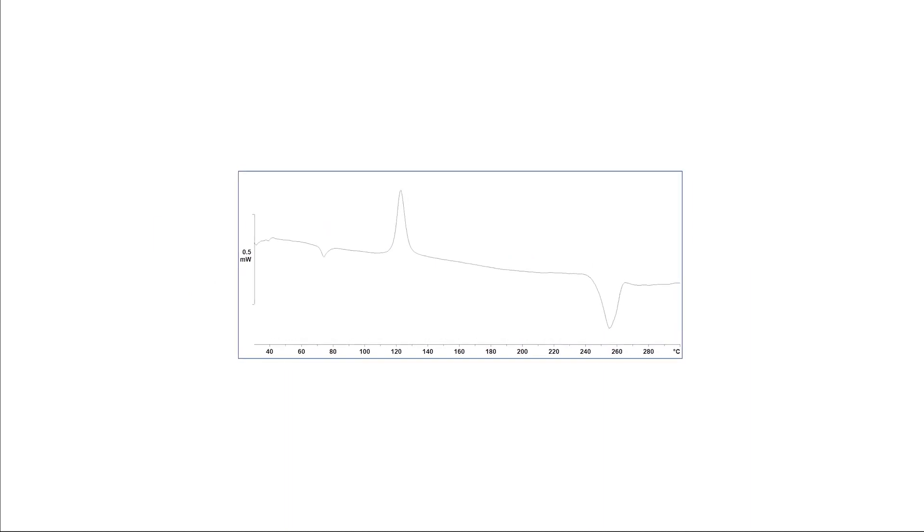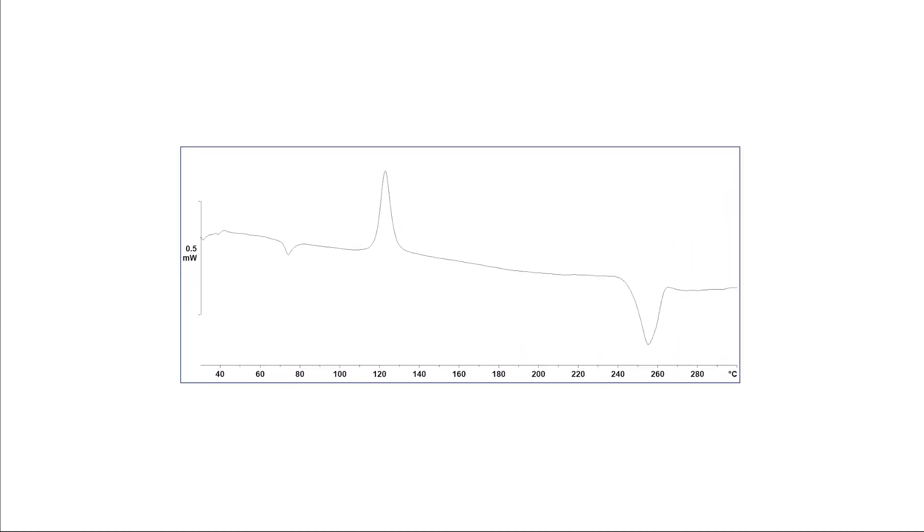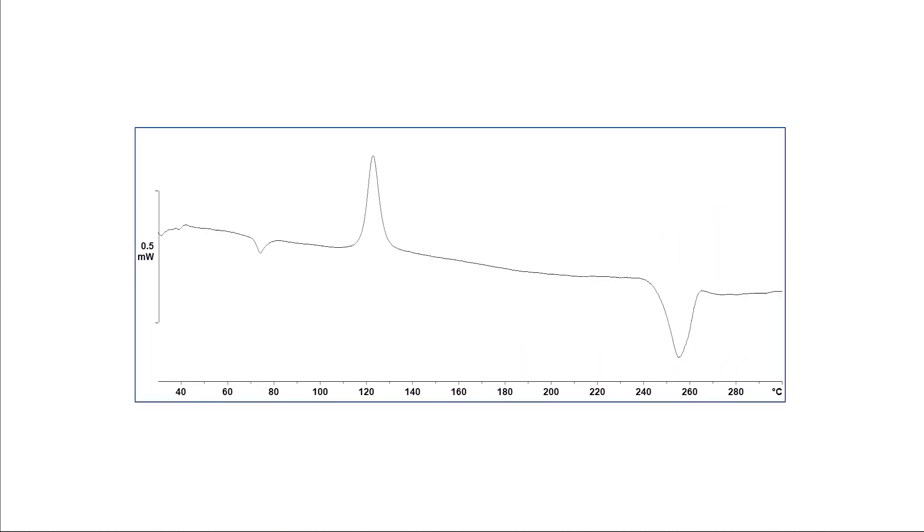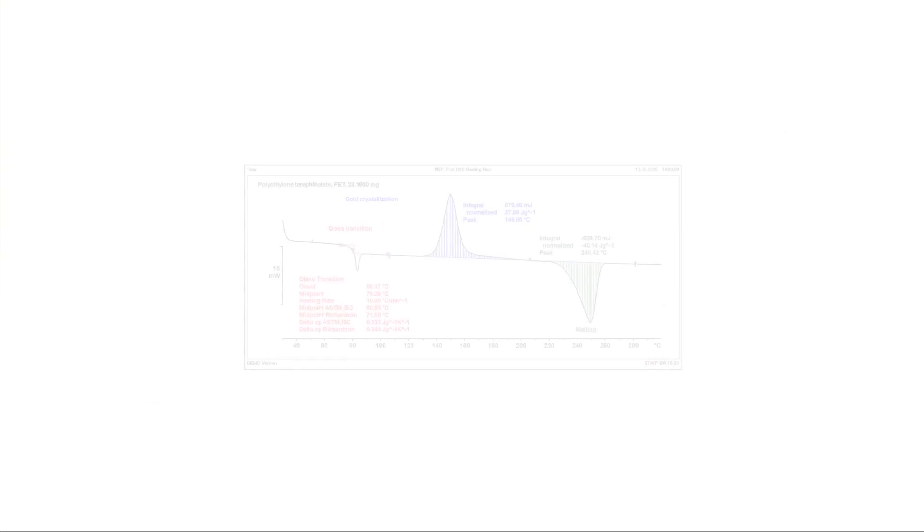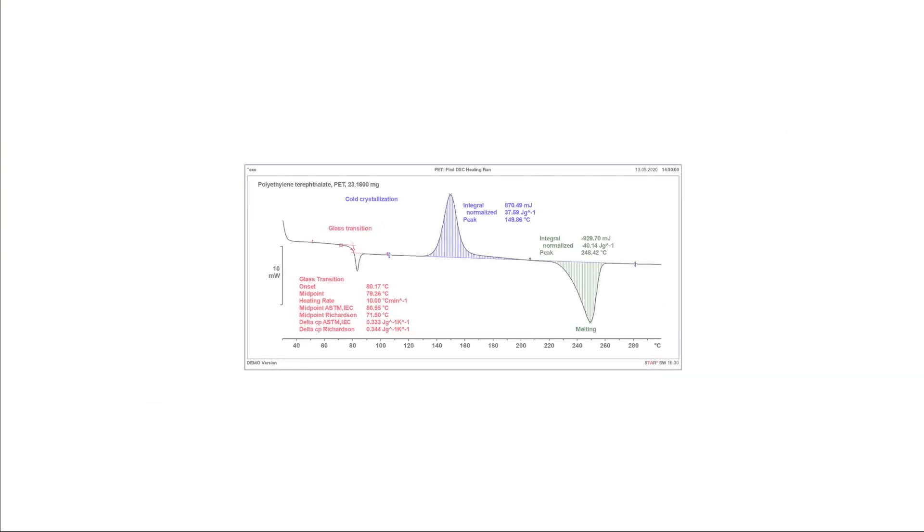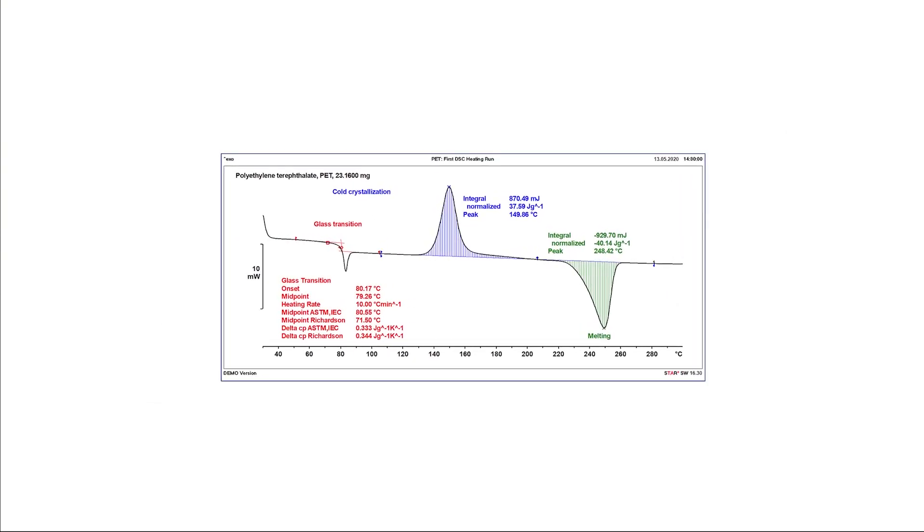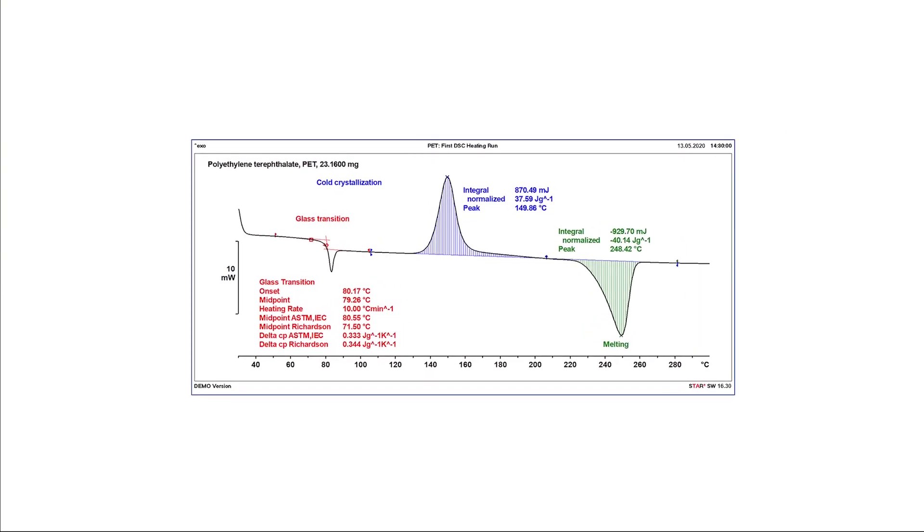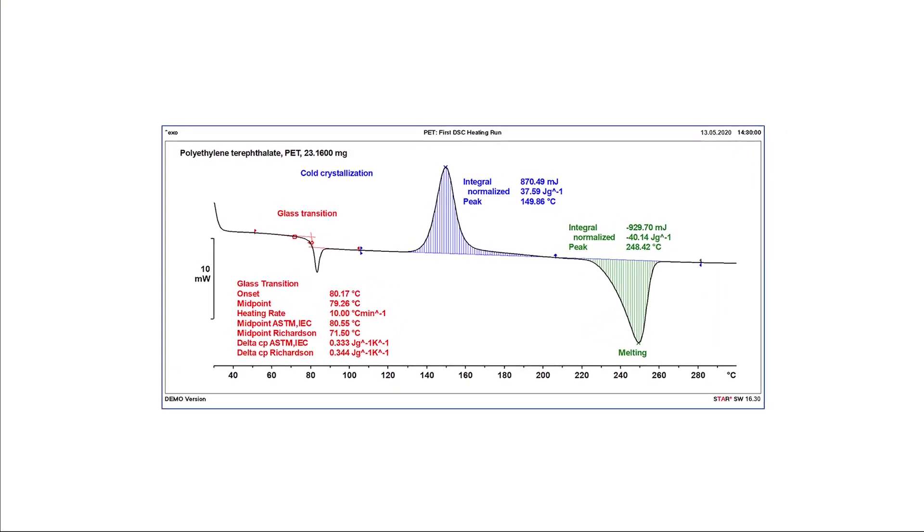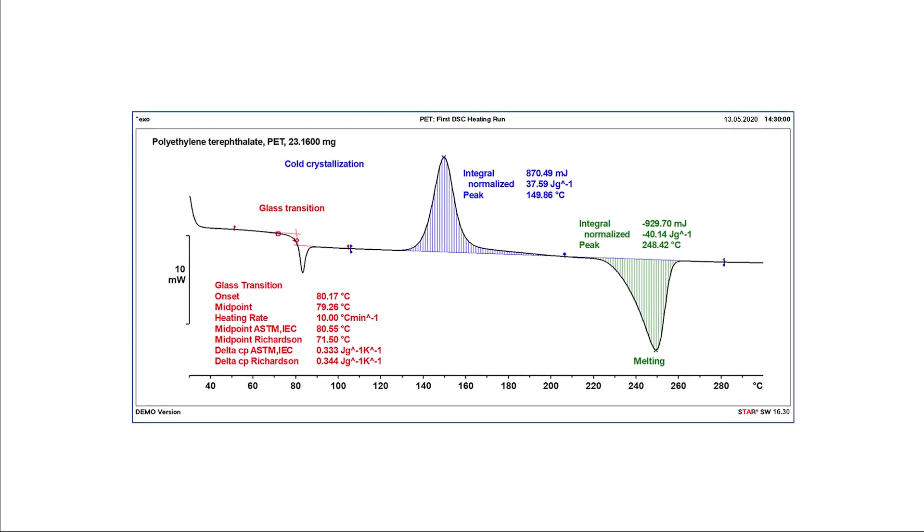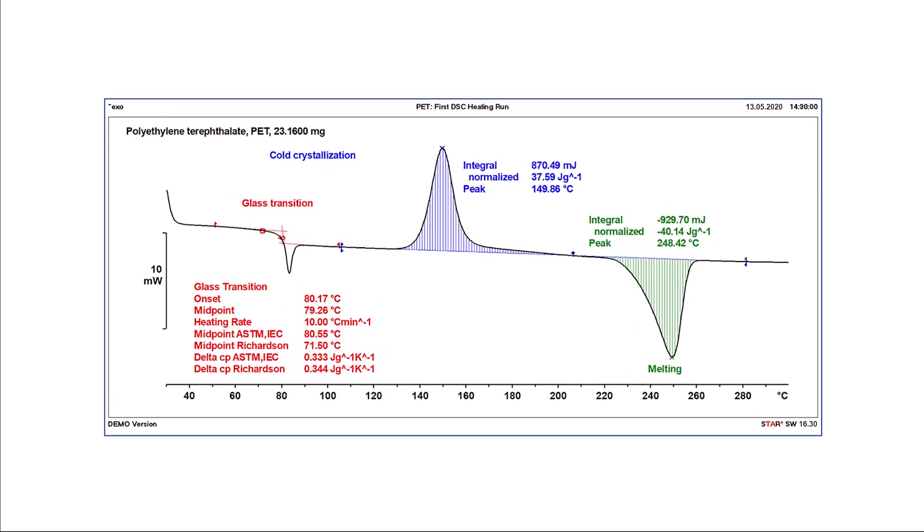When it comes to presenting data, nothing is more effective than a well-designed table or graph. Part one of this series provides an overview of STAR-E software's extensive plot design features, which offer the flexibility to customize every detail of your thermal analysis result curves and evaluations.